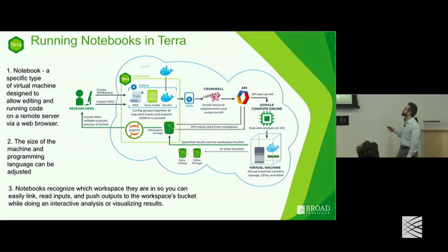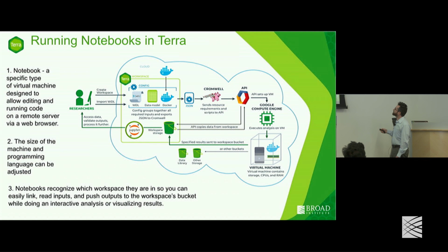But once you launch a workflow analysis that has some data attached to it, has some workflow development language instructions, and whatever tools might be necessary inside the Docker, once those get launched, that tells our Cromwell engine and the Google API to basically figure out how to run this computation as efficiently as possible on a virtual machine created specifically for your job inside of the cloud.